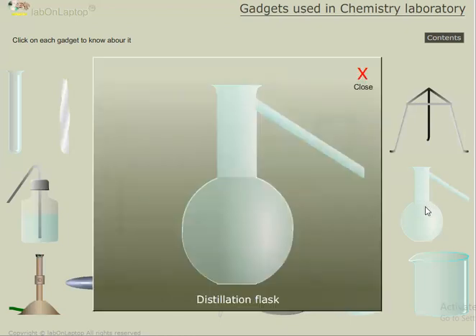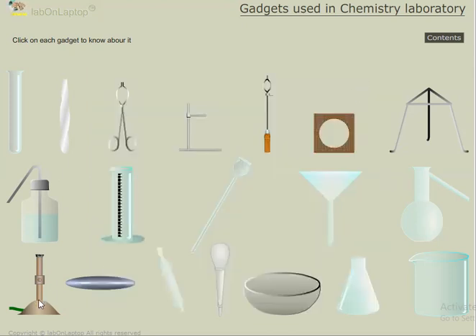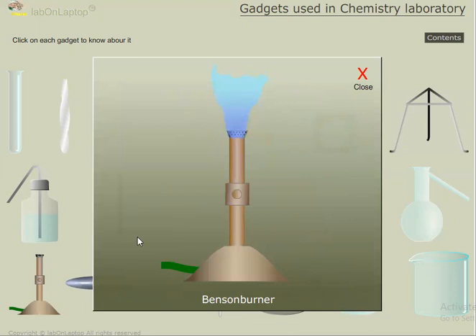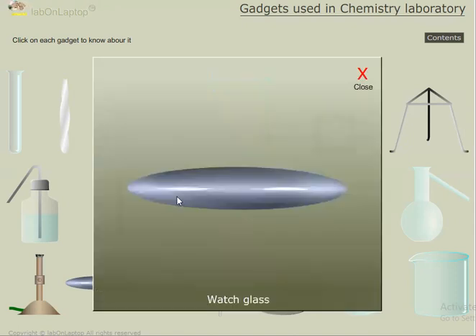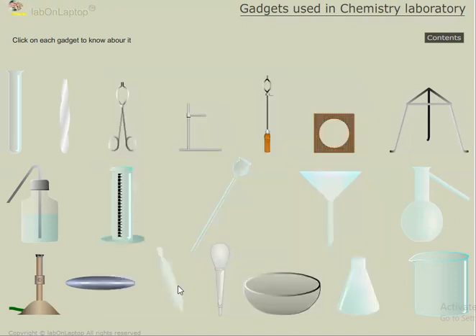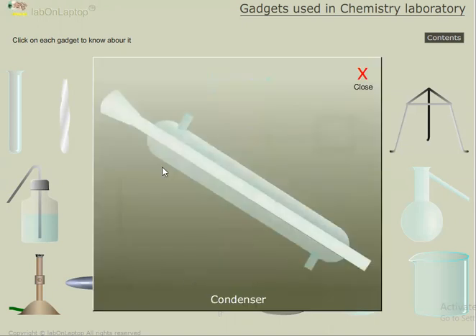And this is a distillation flask. And this is what we call a burner, Bunsen burner. They will keep this Bunsen burner at the bottom of this tripod stand, and then we'll keep the gauze on the tripod stand, and then we'll keep the bowl on the gauze, so that we can turn on this Bunsen burner and then do the experiment after that. And this is a watch glass. And it is a condenser.